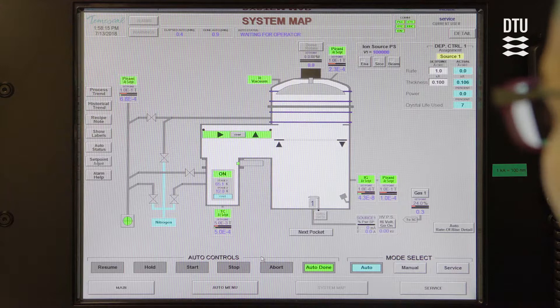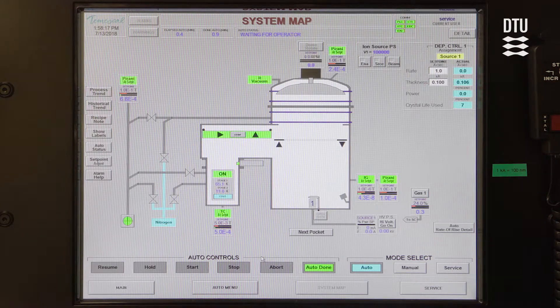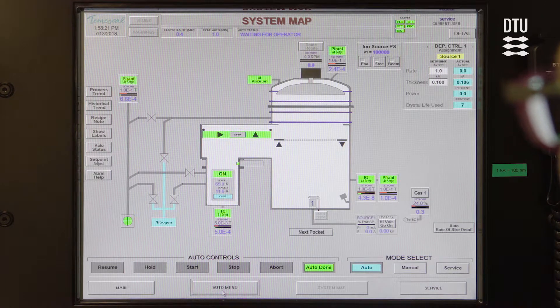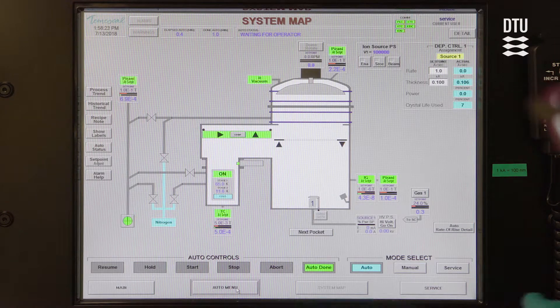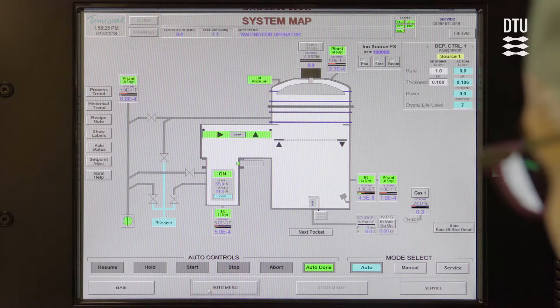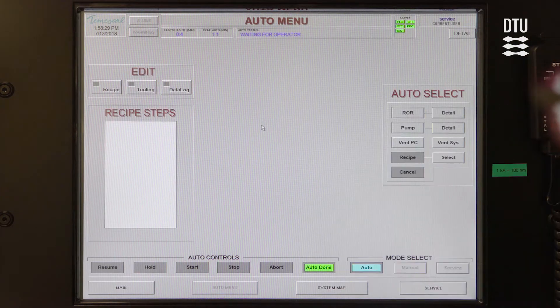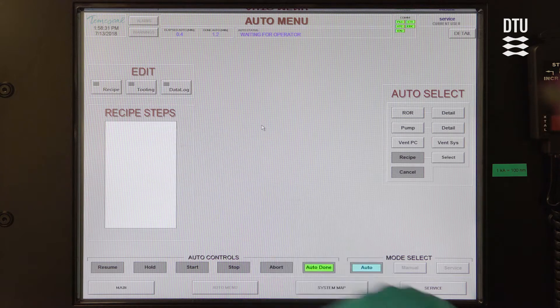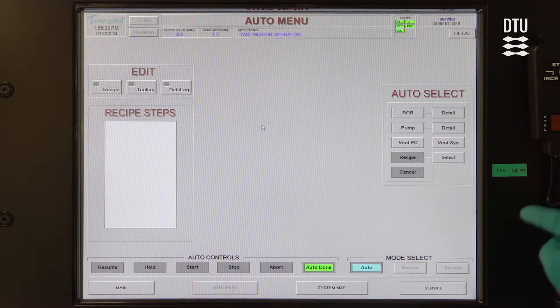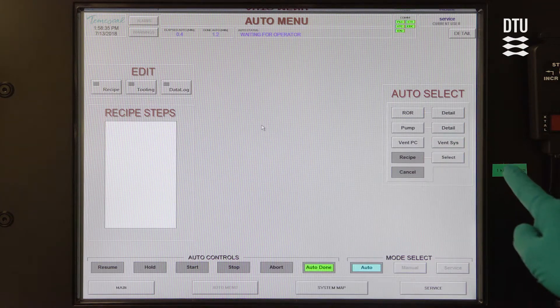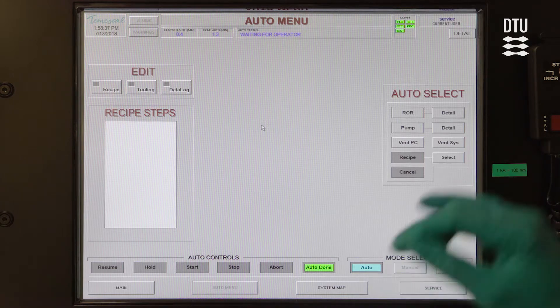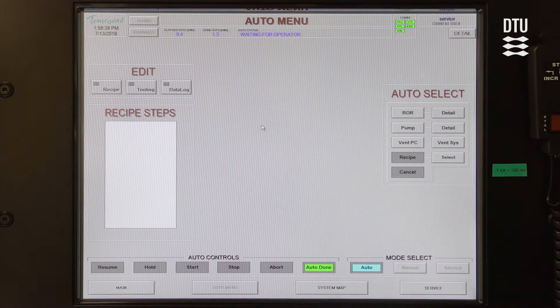When we need to control the system to do something actively, we go into the auto menu, which you find on the bottom bar here. We click auto menu, and now we have the option to edit recipes and to select different actions, including starting a recipe, but also venting, which is the first thing you're going to do when you arrive at the machine.